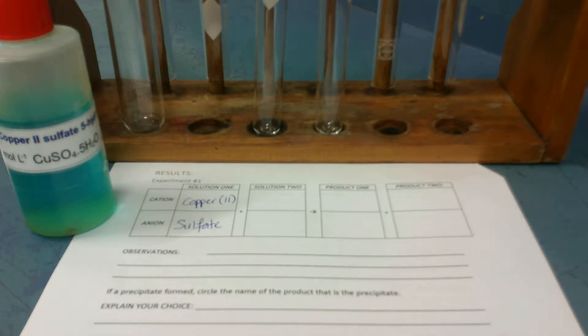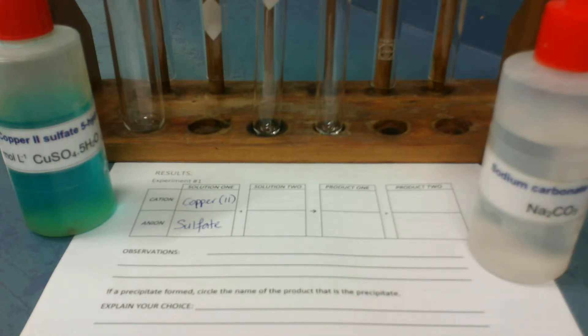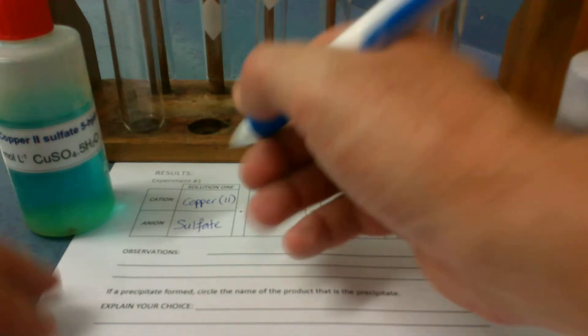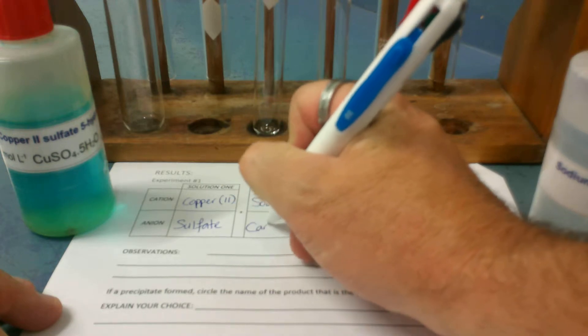The other chemical we're going to use for this experiment is sodium carbonate being mixed with it. So that's solution number 2. So I write sodium at the top and carbonate below it.